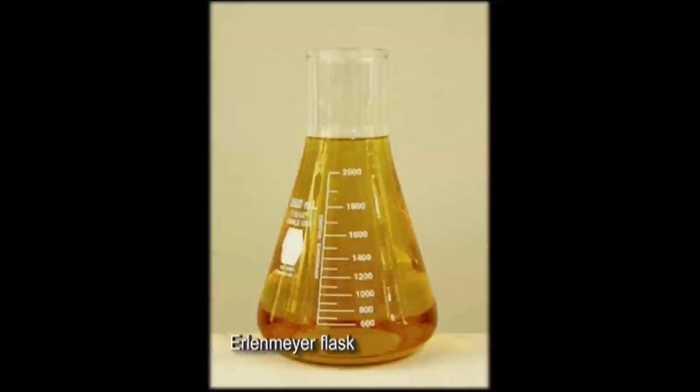Ma'am, what is the purpose of the Erlenmeyer flask in the MIC experiment? The Erlenmeyer flask is the common flask which we use for growing bacterial culture in the lab. It contains the medium, and when inoculated with the bacterial strain, it is placed on a shaker. It allows the growth of bacteria in a larger volume. So this is used as a source of the bacterial strain, which is used for performing the MIC.